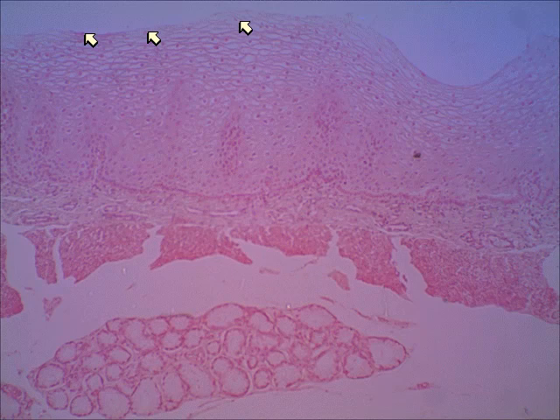I see little nuclei here and there. So that means they're living. They're not keratinized. But all of this area right there makes up the mucosa. And then the rest of what you're seeing is submucosa. And within the submucosa, do you see right through there? I've circled part of one of those mucus glands.